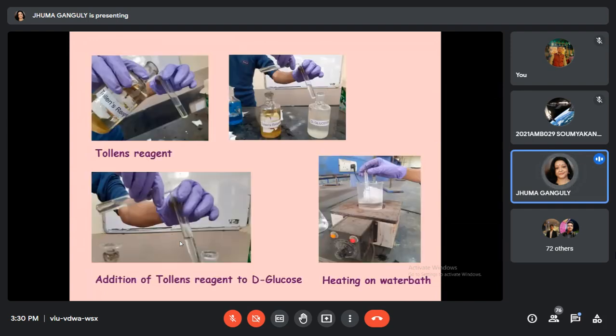Like this way. Because we have not used these for a long time, rust has come, and sometimes the coils are not working. If you keep it, maybe while running the sample it will break, and the coils will not work. So this will happen after joining.